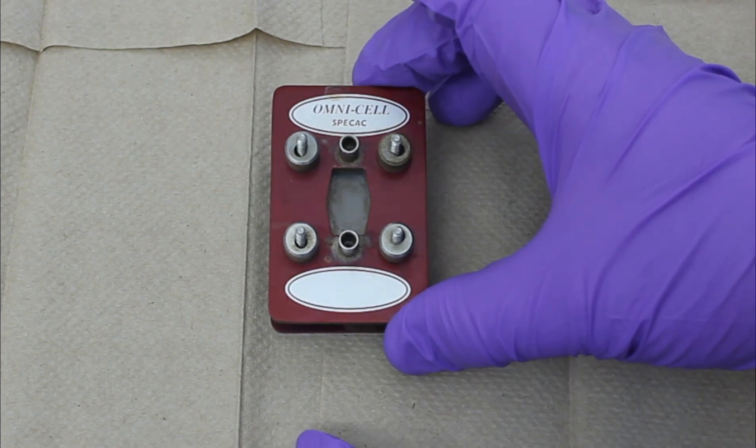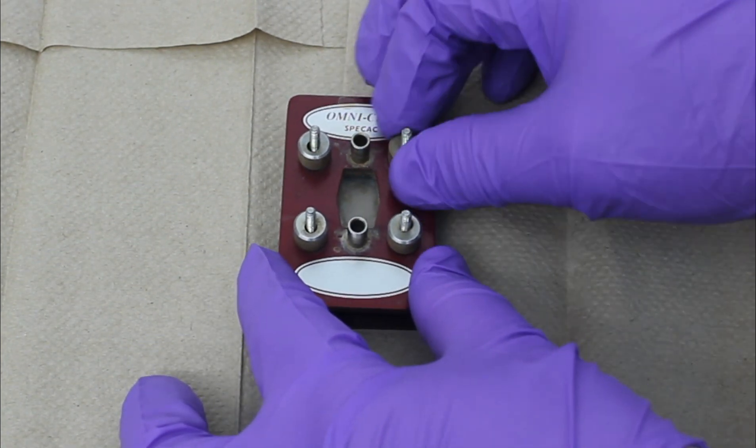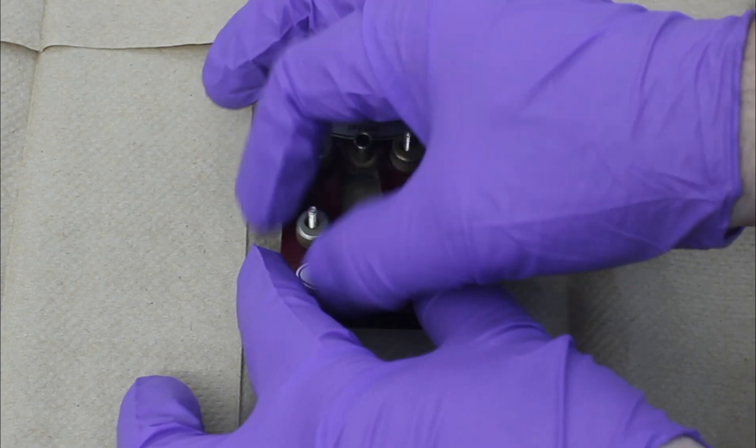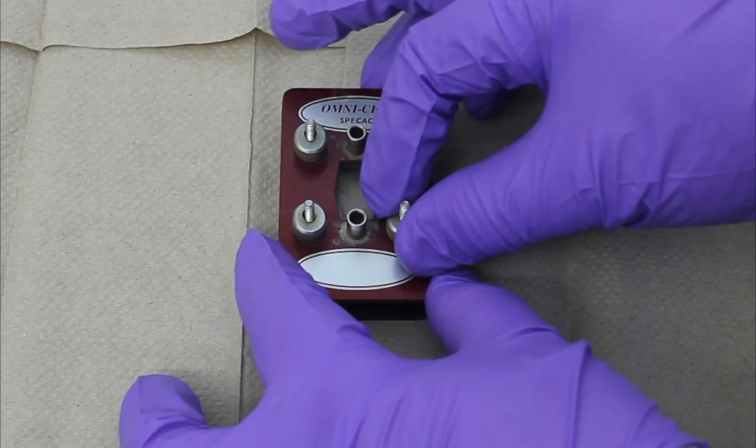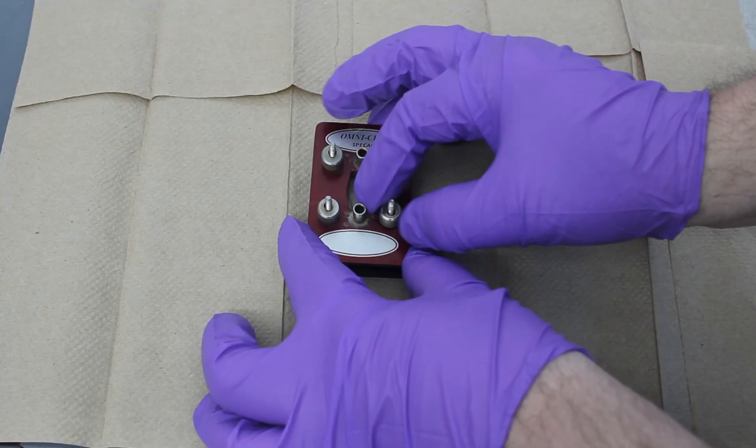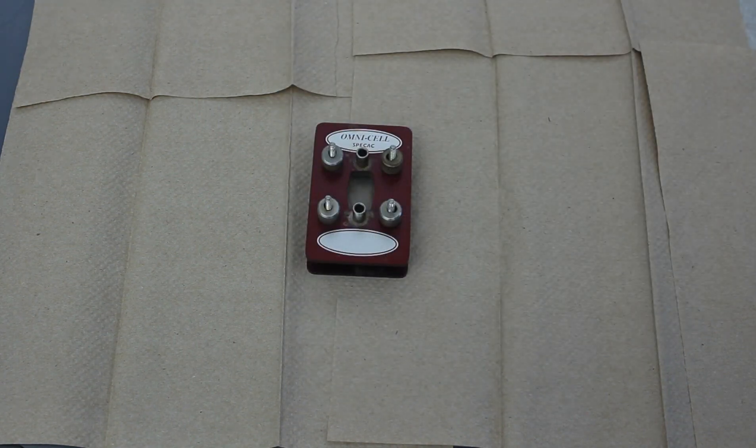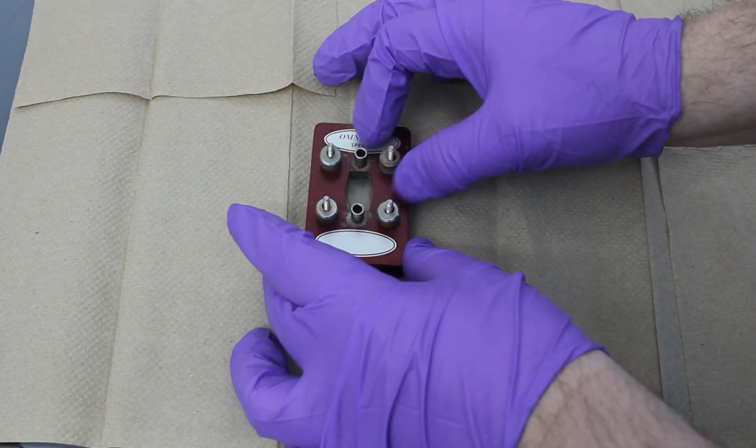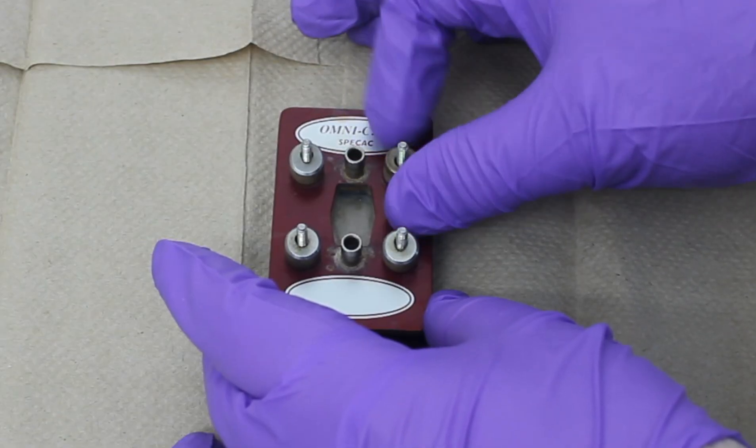This is actually the cell after it's been cleaned up a little bit. So what I'm going to show is how to tear down the cell. When you buy a cell like this, it will have an instruction manual with all the parts and pieces. Make sure you keep that or have it for reference, even if you have to look it up online.